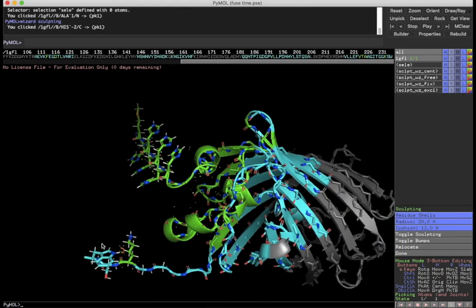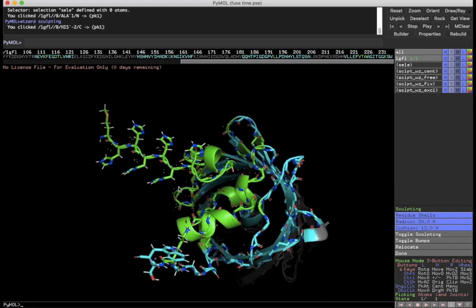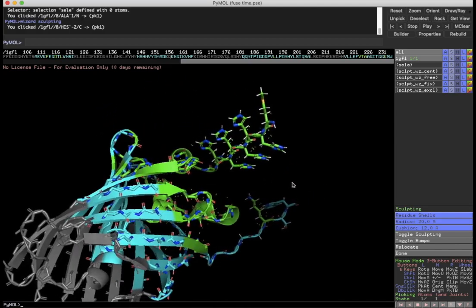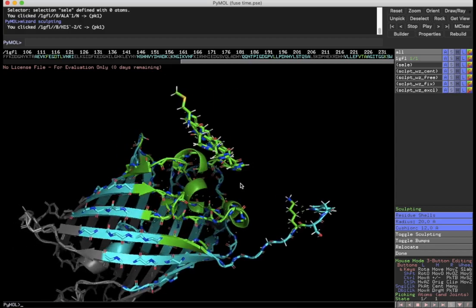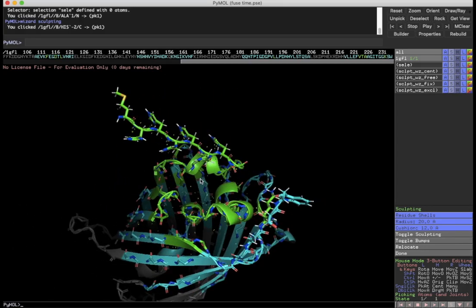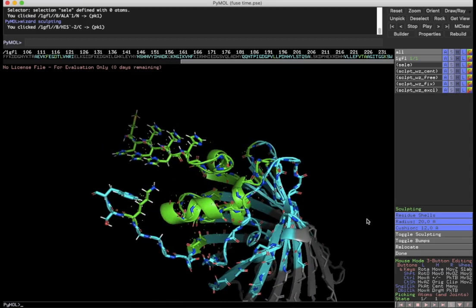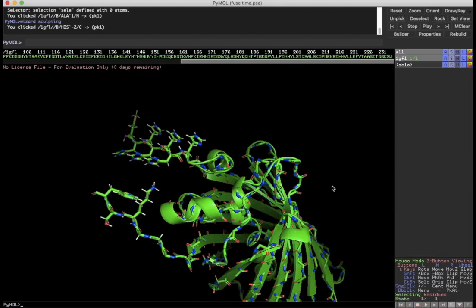There we go. So now we can see our other, similar to before, the tryptophan and the lysine residue like to separate apart a little bit. Still moving a little bit. You can see some of the histidine residues are still moving. Again, you can let this model run overnight if you want to on your computer. I'm going to stop it here.